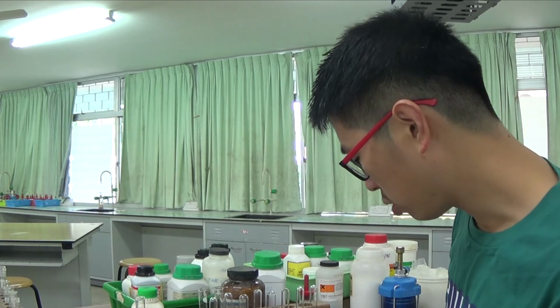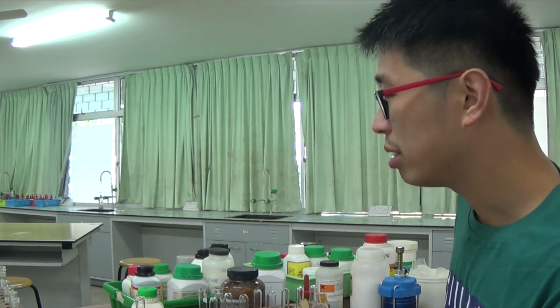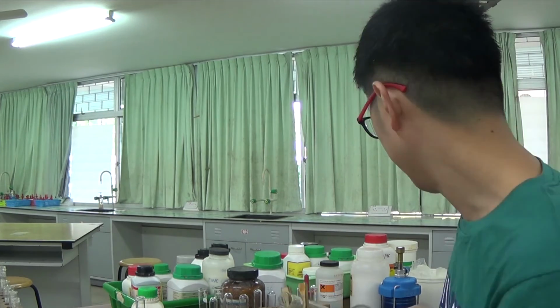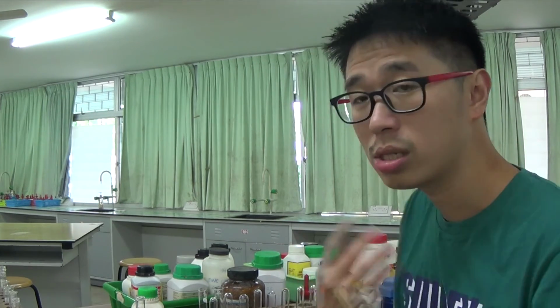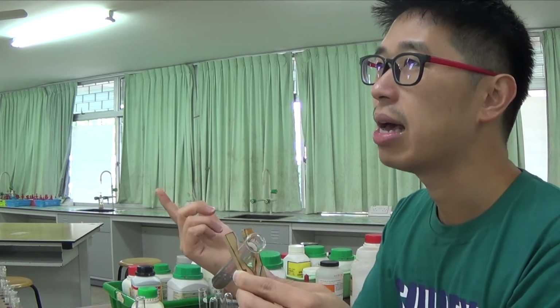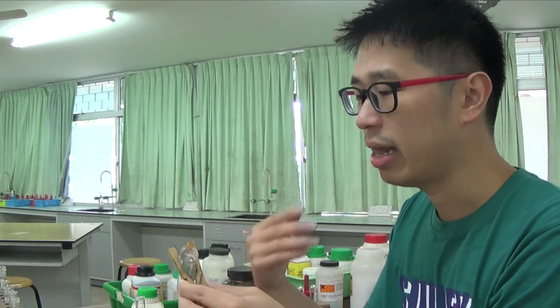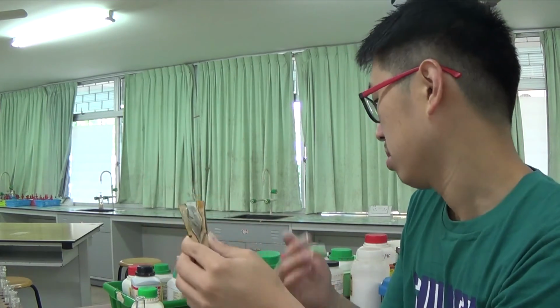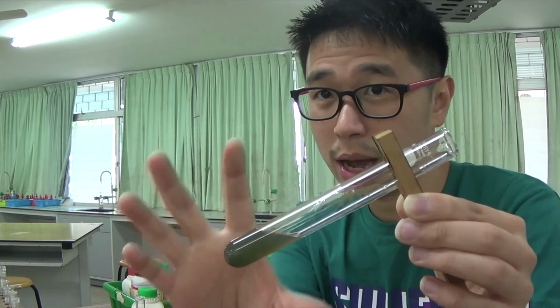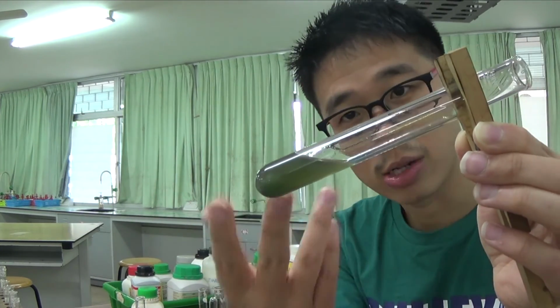Okay, so just to finish off, I want to test for the cation as well, because they can provide this scenario as a mystery to you, something to investigate. They say it contains another colorless cation, another cation which produces colorless solution, and how do you test for it? Well, in the presence of sodium hydroxide, when you get a green color precipitate, can you tell calcium is present?